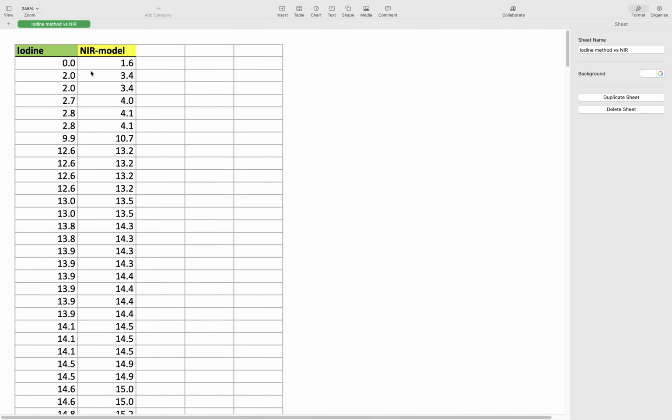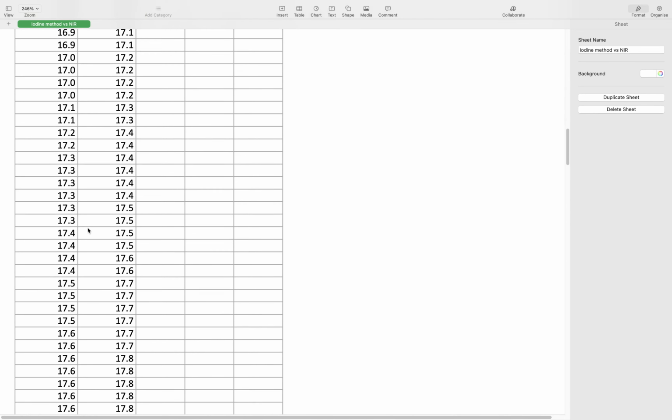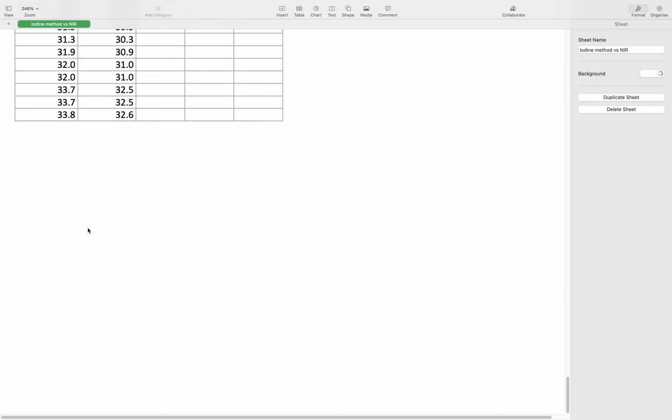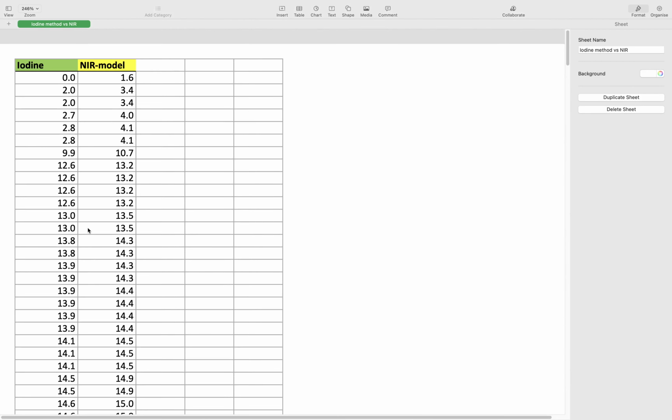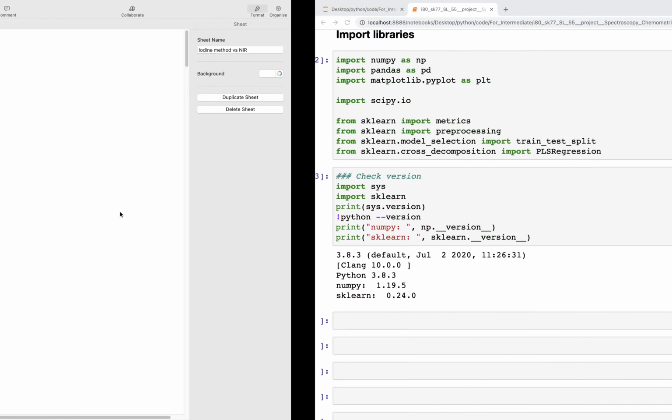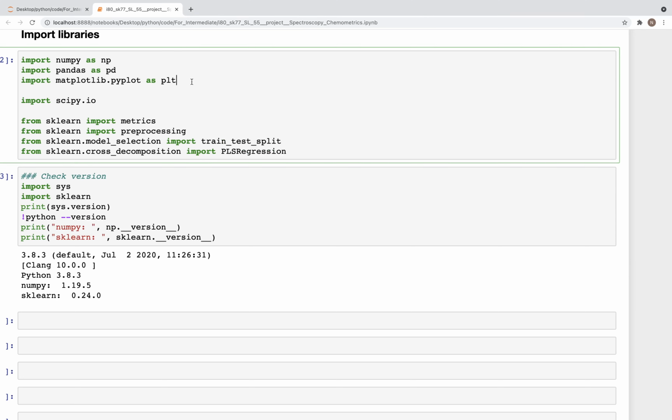And now for data, we can look at this file. As you can see, the amylose content goes up to 30%. It ranges from 1 to 30, if this is the amylose content that they are referring to. And the second file, we'll look at it when we read it in Jupyter Notebook. So let's get into Jupyter Notebook now and see how we can do that.